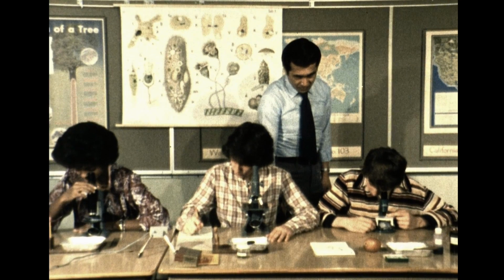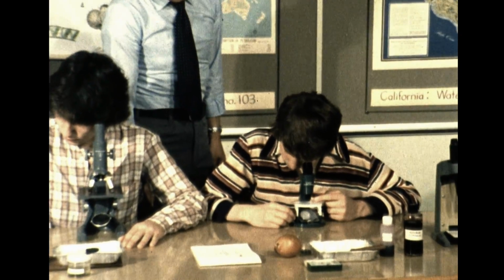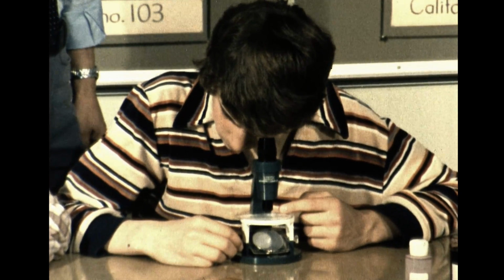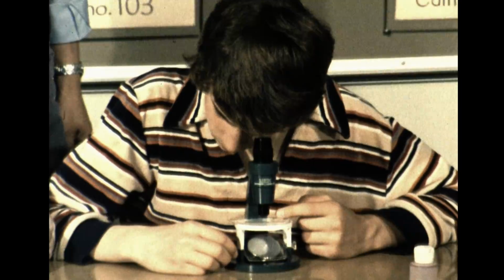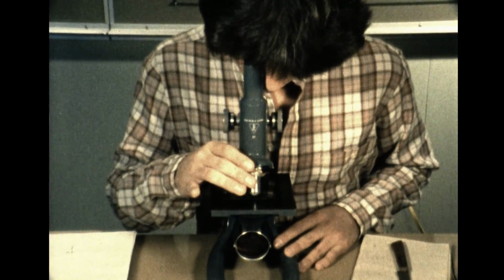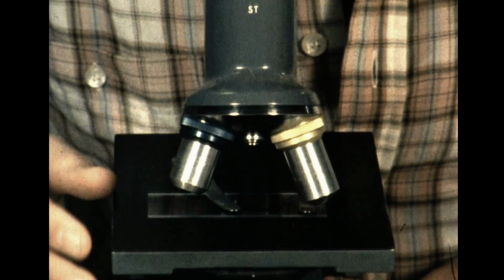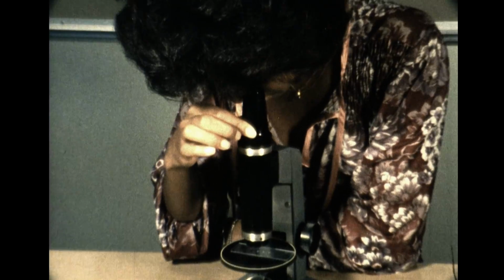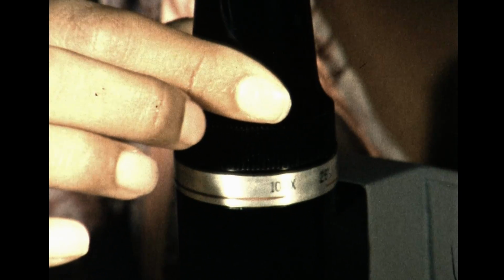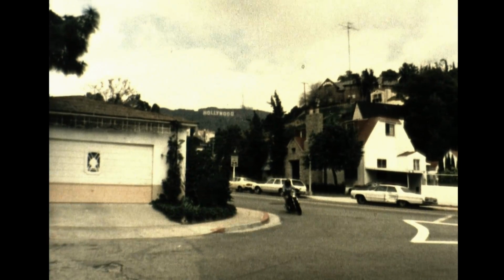A microscope has the combination of lenses which produce this magnification, resolution, and contrast. The single objective microscope has one power of magnification. The double objective microscope provides for 2 degrees of magnification. This microscope produces different degrees of magnification through a zoom effect, a technique used frequently by the motion picture cameraman.